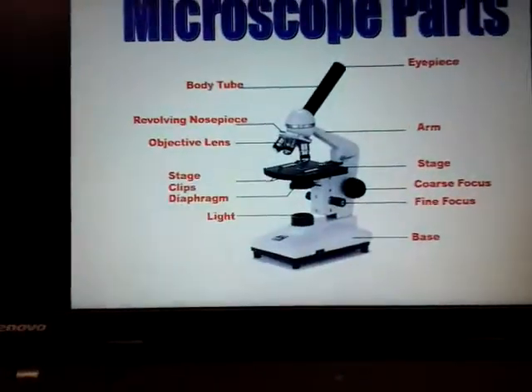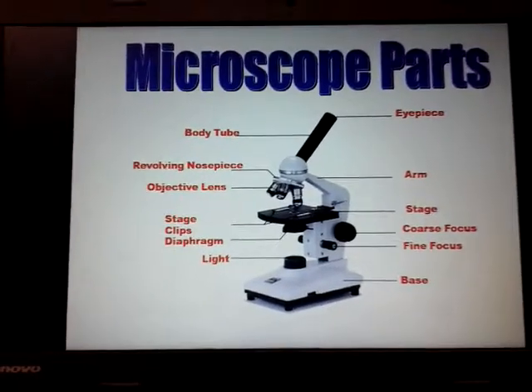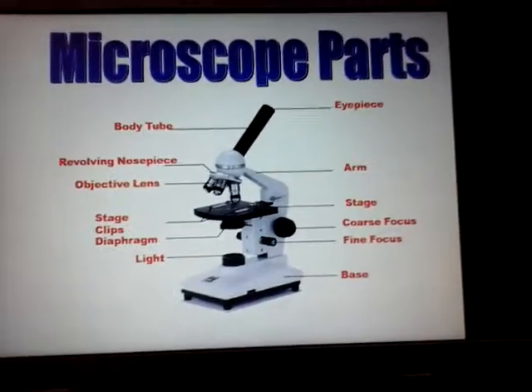And then we have our light source. And the light source, obviously, for us is going to be a light bulb.